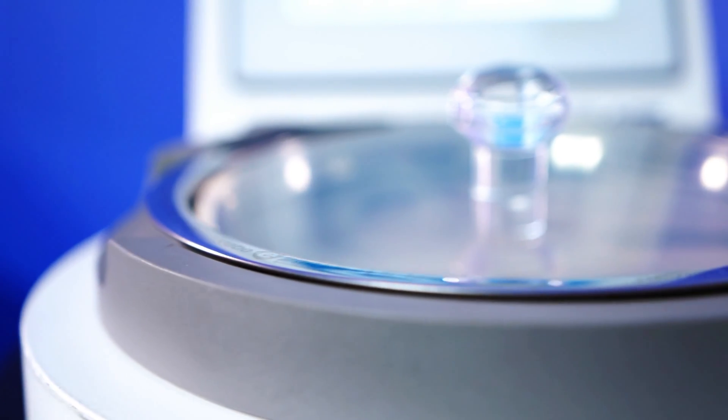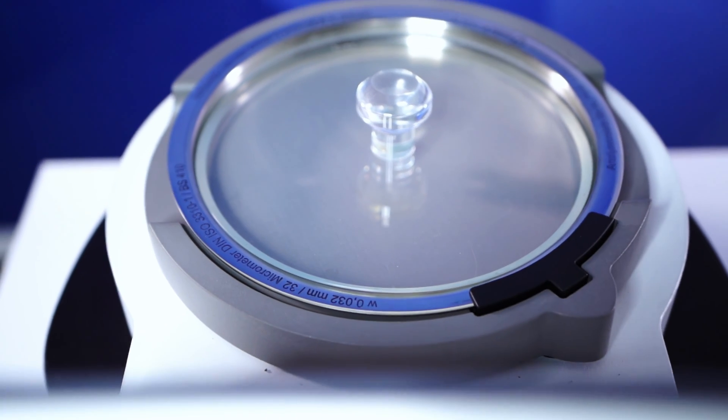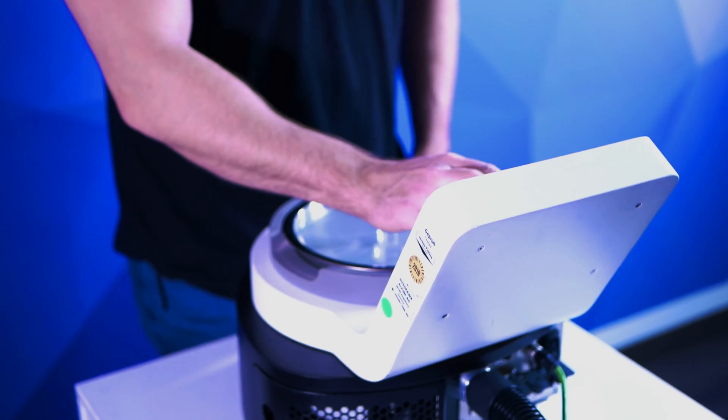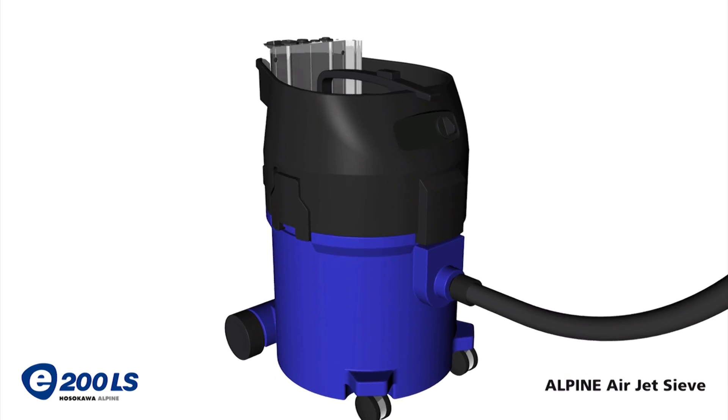Possibly the biggest downfall of the Alpine is that, whether you use a traditional or an RFID sieve, the process is fairly hands-on. The fact that you must physically swap out each sieve in the sieve stack makes testing longer than if a sieve shaker or dynamic image analysis system is used. This also increases the chances of human error, especially if SOPs and RFID sieves are not implemented in your process. Additionally, because the Alpine relies on an industrial-grade vacuum to generate its iconic air jet, it can prove to be loud during operation — much louder than dynamic image analysis systems, but quieter than a mechanical sieve shaker.